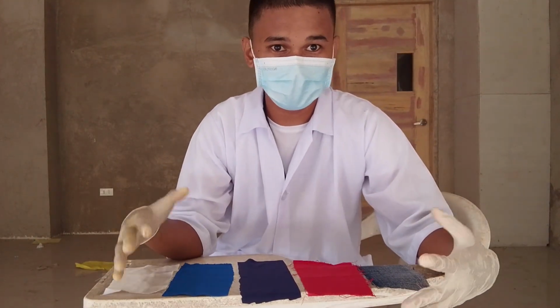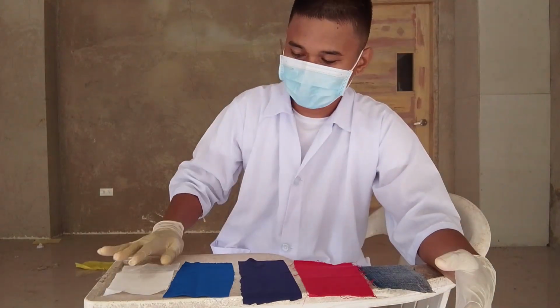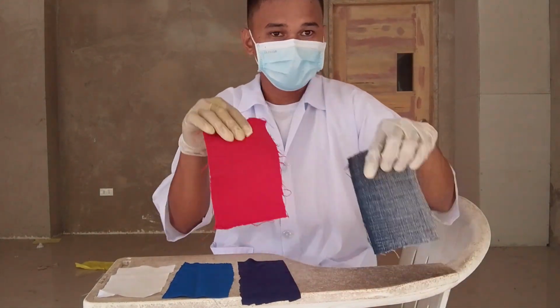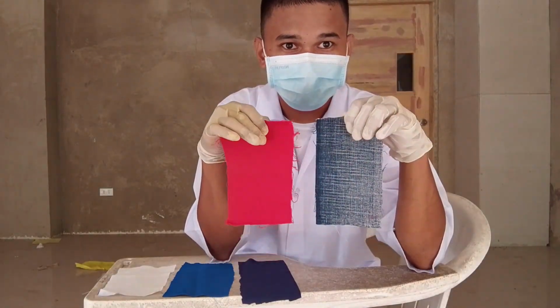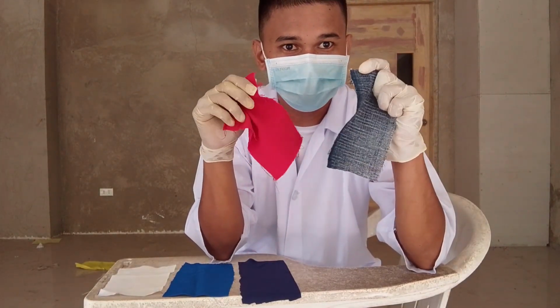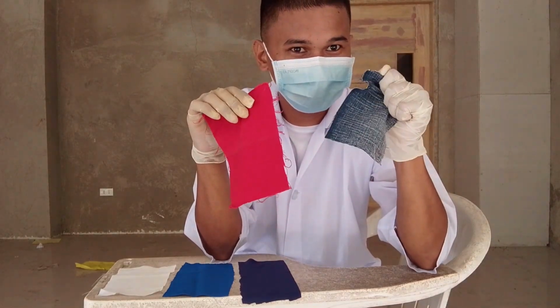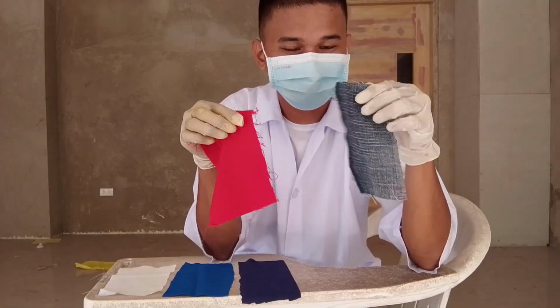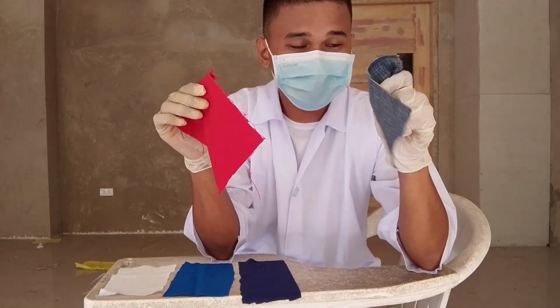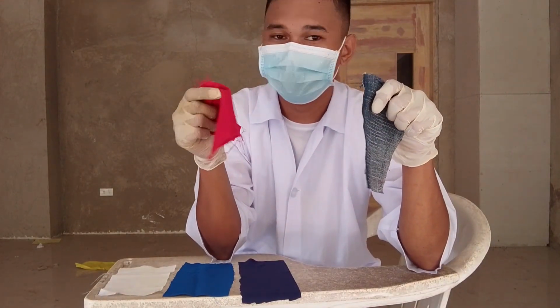So I am done differentiating these 5 different types of fibers. I will now proceed to the comparison of these fibers. Let me first compare these two, the denim fiber and the cotton fiber. For the denim fiber, it is hard, like a hard texture. Unlike the cotton, it has a soft texture.